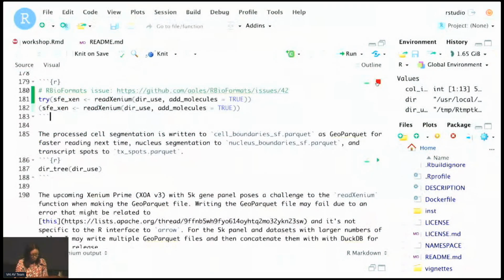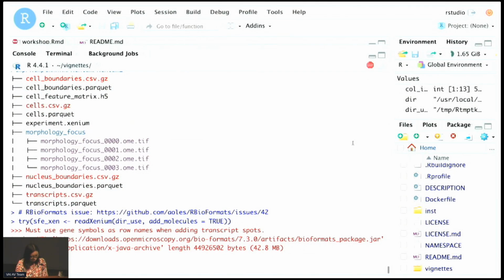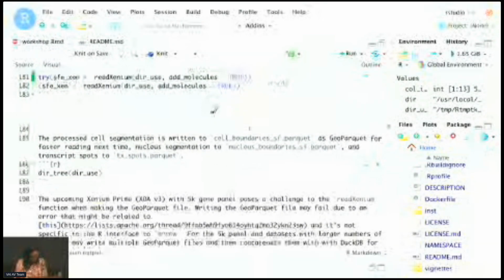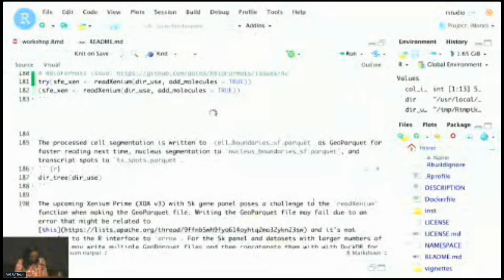So here I would load the data into R. Oh, here it's installing RBioFormats.